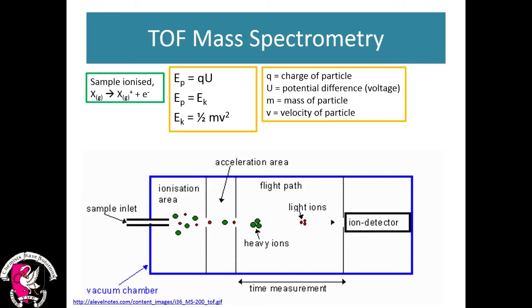So when we get our graphs, the x-axis is mass to charge ratio. So it's basically like how is the time it takes related to its mass and its charge. So if you want to do that, you can have a little play with those equations and get something in terms of time for mass and charge. And for anyone that's interested, I'll just show you at the end as well, so you can have a look at that.